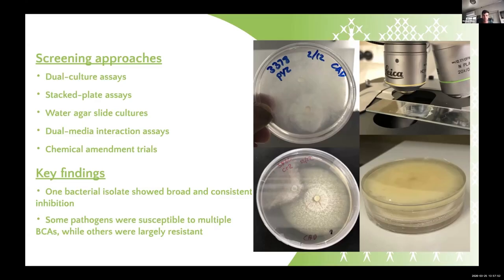So across all screening methods, antagonistic interactions were highly variable and pathogen specific for most species. However, one bacterial isolate consistently inhibited multiple pathogens, which is my suggestion for Dr. Rebecca to carry on through for further trials.